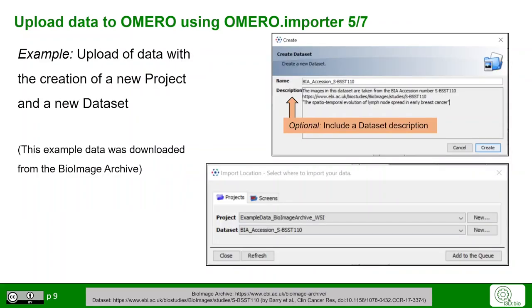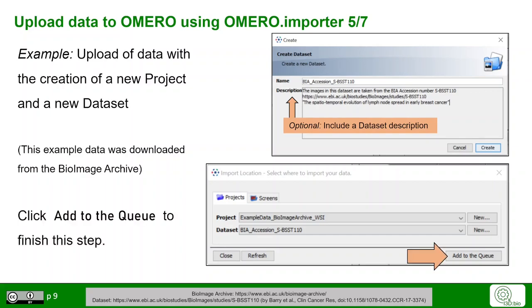Let's create a new project and a new dataset. Here we downloaded images from the BioImage Archive to show the process. Upon clicking New in the lower window, you can choose the name and optionally include a description for your new dataset or project. Click Create to finish, then click Add to the queue.